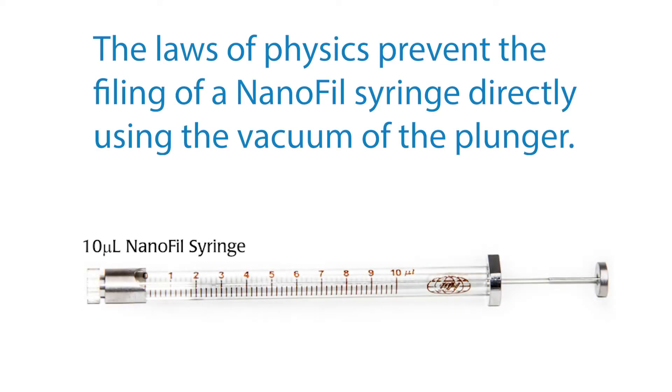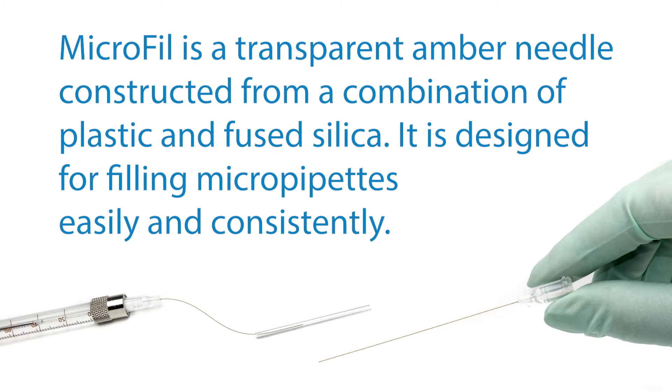The laws of physics prevent the front filling of a NanoFil syringe directly using the vacuum of the plunger. So today I'm going to show you how to use MicroFil to front fill a NanoFil syringe.